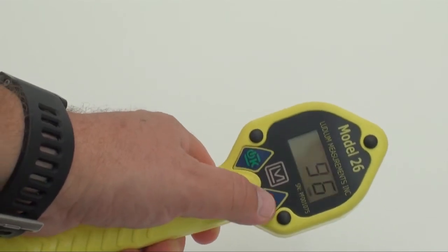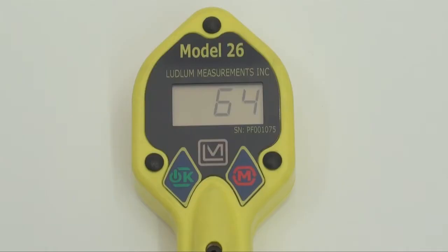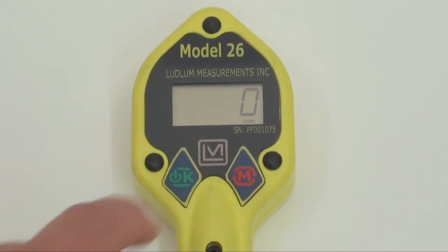The unit is easy to operate via the two buttons on the front panel. All routine operations and programming are accommodated via these two buttons, so no external equipment or software are required.